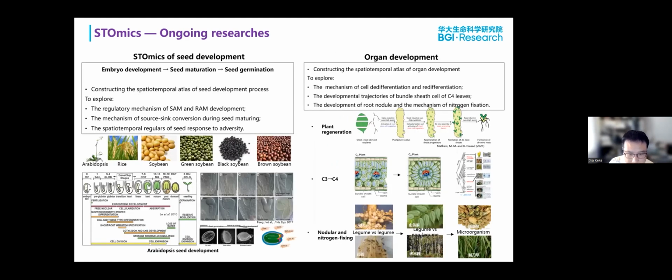We have also carried out spatial-temporal omics studies on important plant organs and developmental processes.